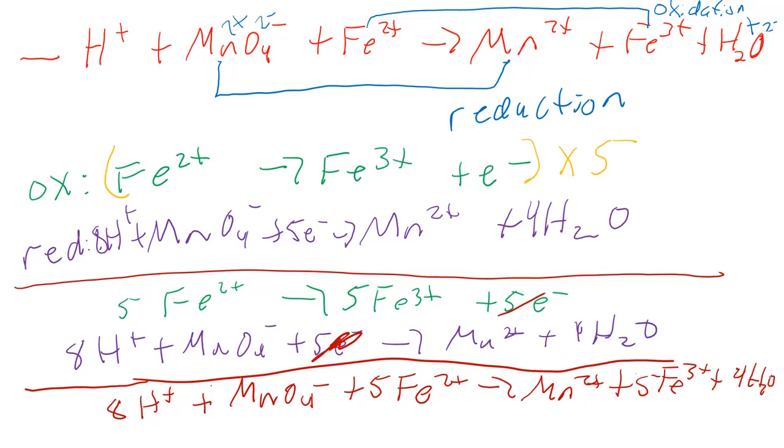So what you're going to do is get some potassium permanganate, and fill up your burette with that. Remember, with a burette, we read it from the top down, not from the bottom up. And you're going to get 5 milliliters of your unknown iron solution, and add some phosphoric acid and deionized water to make your iron solution.